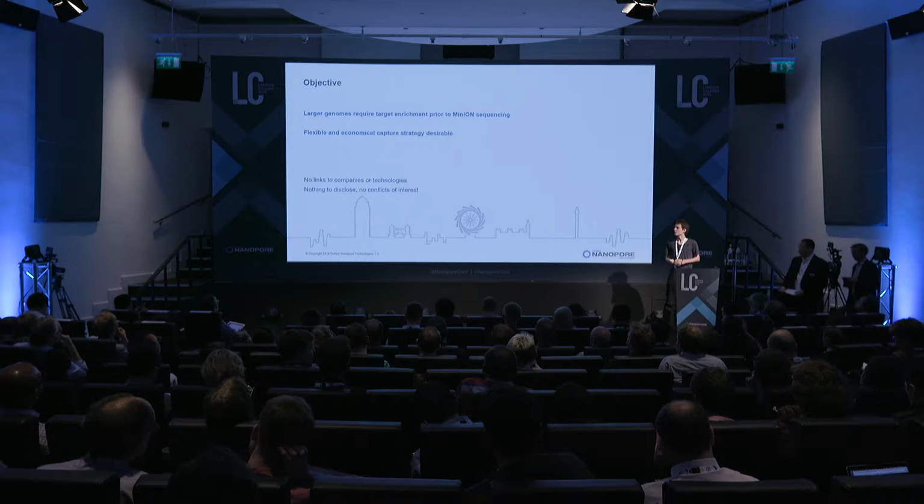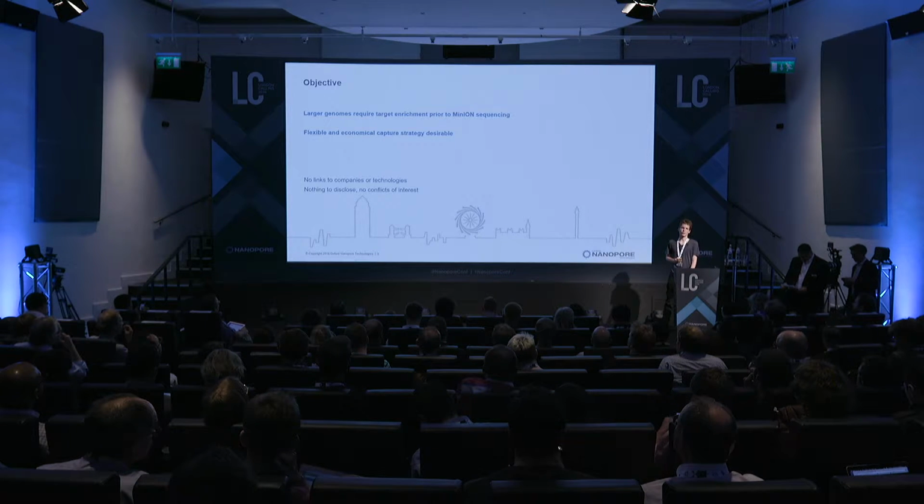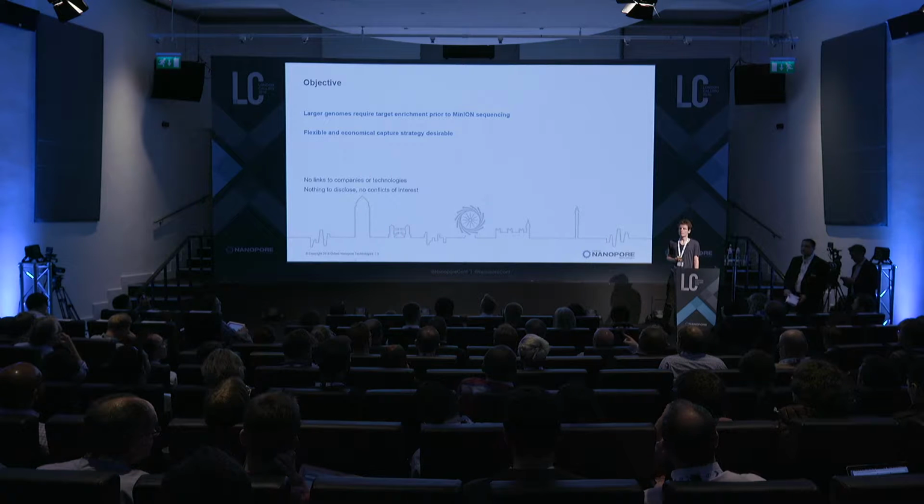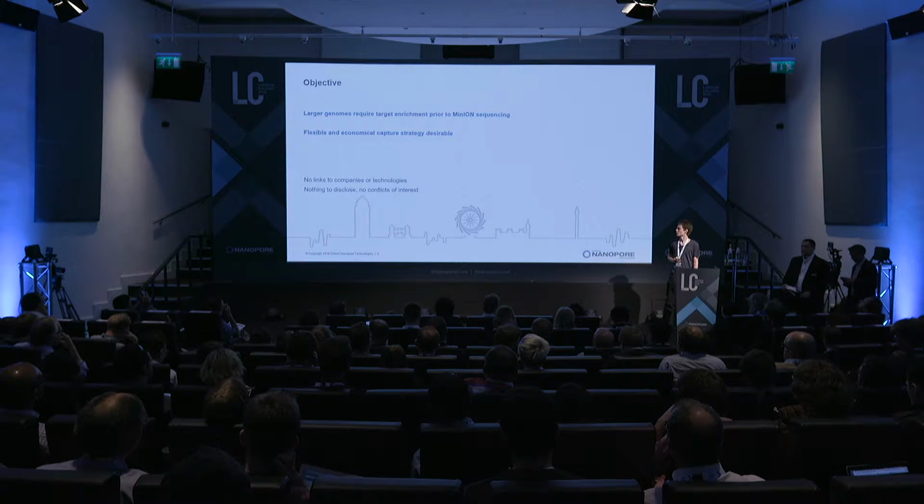In the case of larger genomes, such as humans, target enrichment is required prior to MinION sequencing to obtain sufficient coverage on loci of interest. I'm currently working on development of a flexible and economical capture strategy.